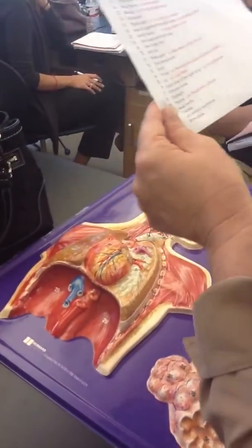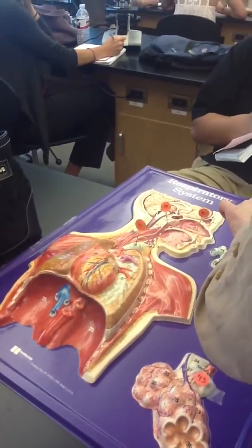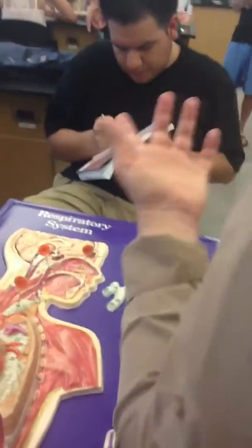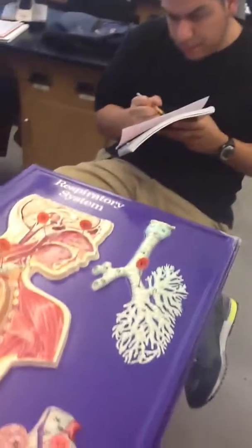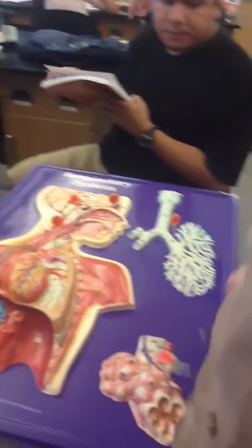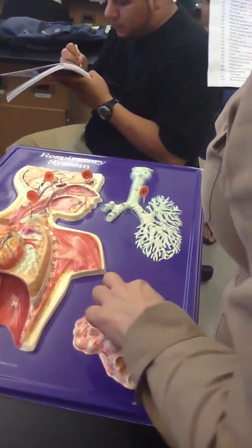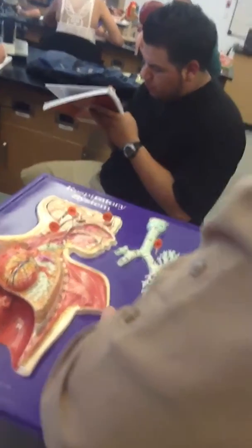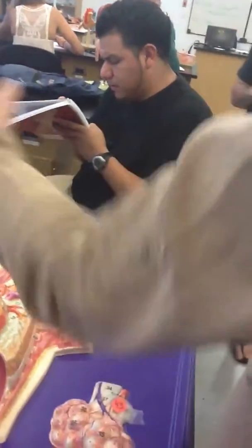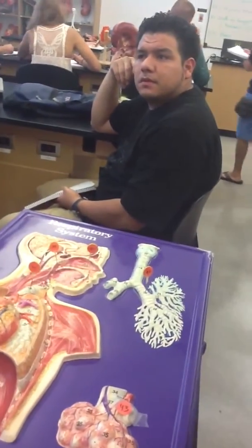41 is the trachea. 42 is the left primary bronchus. Left main, left primary, definitely. It's accepted if you write the left main or left primary. So we are in 43. What is 43? Oh yes, it's here. 43 is the bronchiole. If you detach this, you will see that it's a bronchiole. You see? It's a bronchiole.